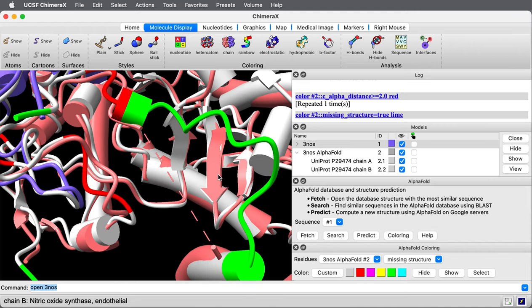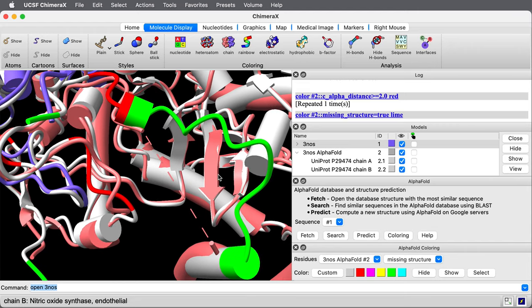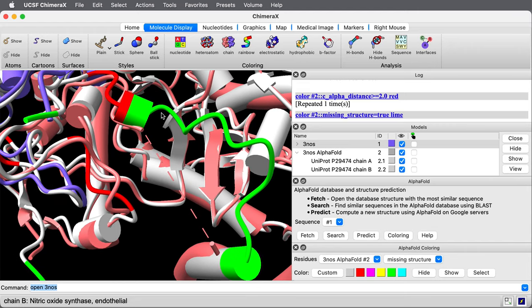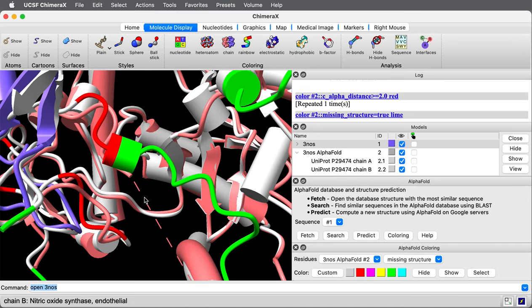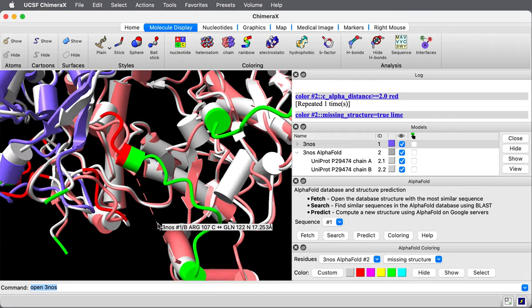We'll also see this loop here in green that also is not resolved. And we can see this pink dashed line, which is how Chimera X displays missing residues in experimental structures.